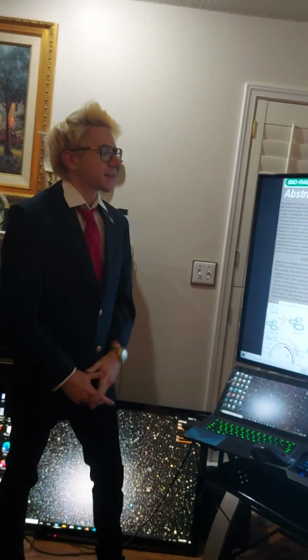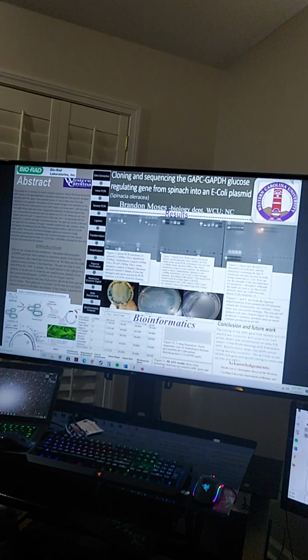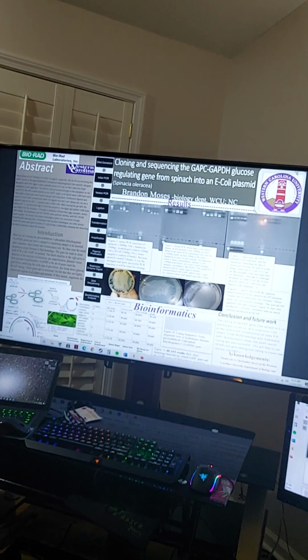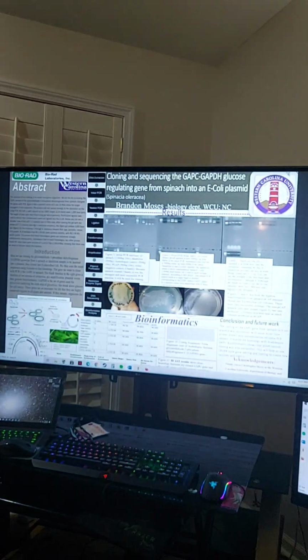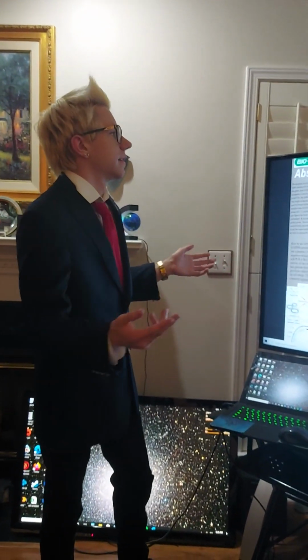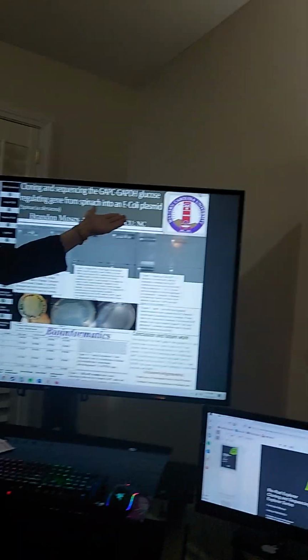So this is my presentation on cloning and sequencing the GAPC-GAPDH glucose regulating gene from spinach into an E. coli plasmid. Spinach being Spinacia oleracea. This is from the biology department at Western Carolina University.